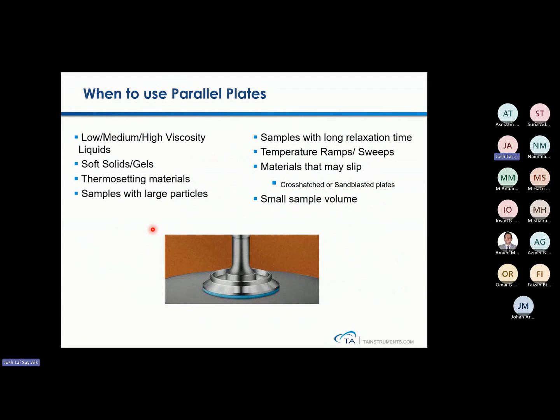So when to use parallel plate? Typically, parallel plate is for liquid samples that are slightly thicker and can stay in place on a flat surface. Typically for soft solids, like gel materials, cream materials, crude oil, as well as epoxy-like thermosetting materials or samples with large particles. You can use it with samples with longer relaxation time, which are more structured samples or structured semi-solids.